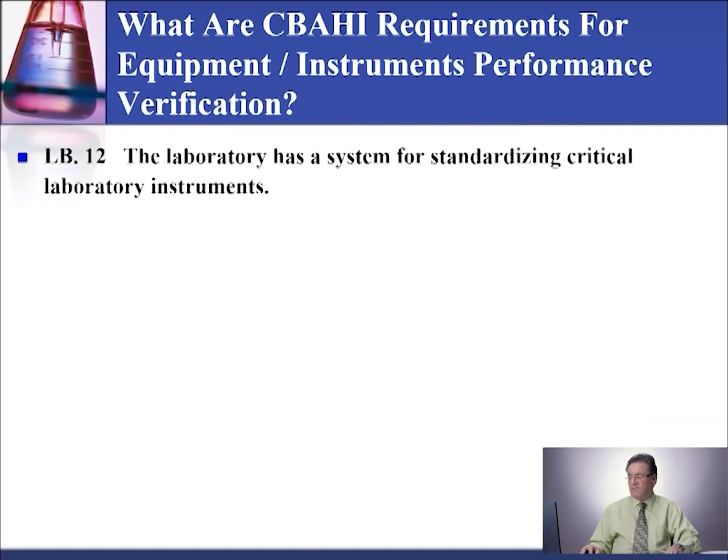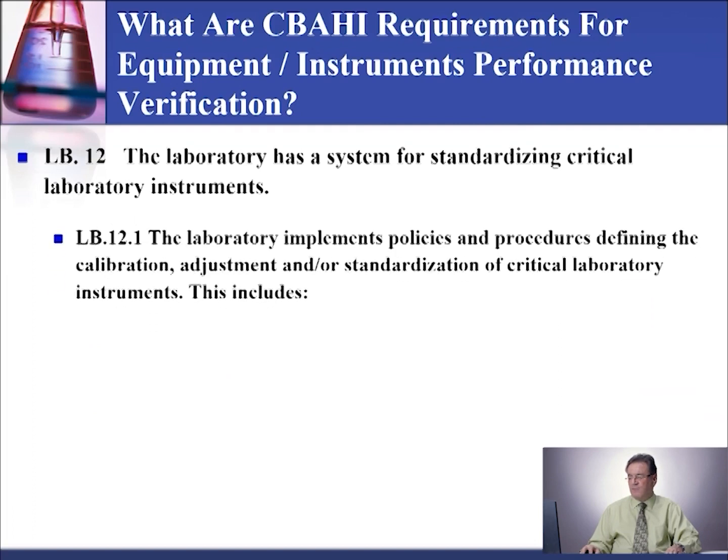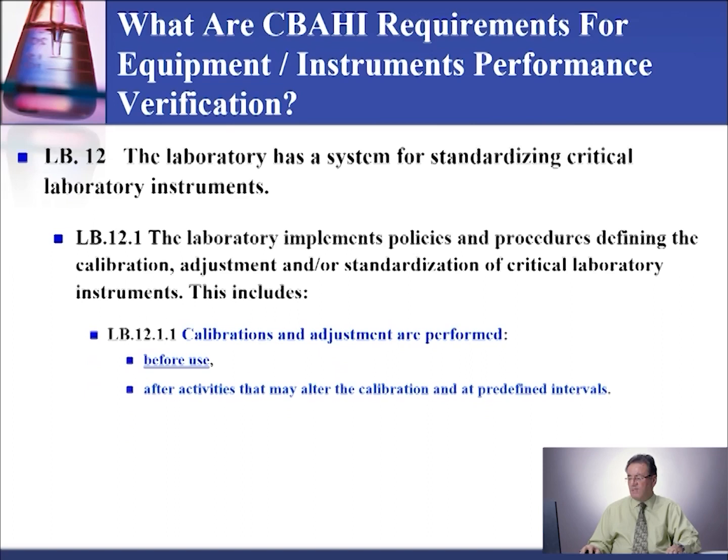The results for the OQ verification need to be documented in the OQ form called the LabGen Operational Qualification Form. As needed, any deviation observed during the OQ step or from the purchase order should be recorded, investigated, and solved before you move on to the next stage.